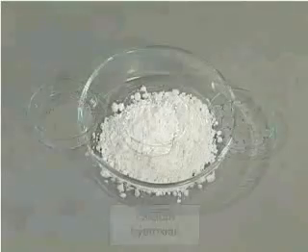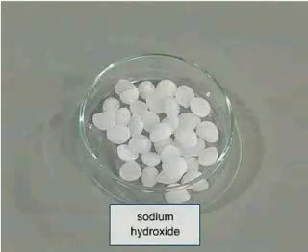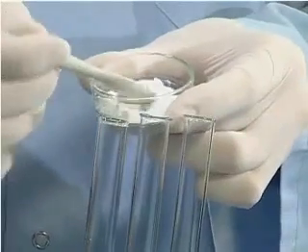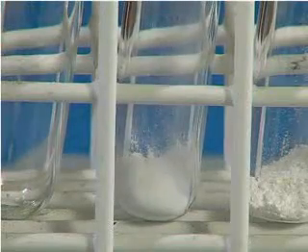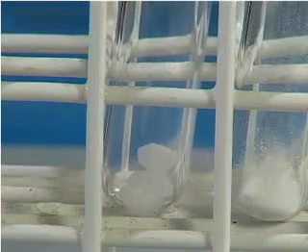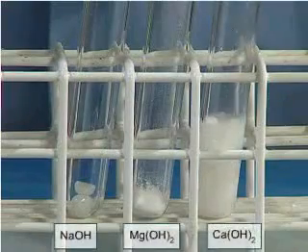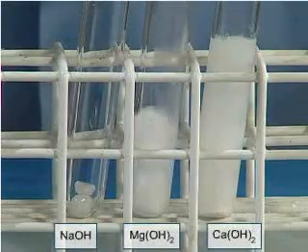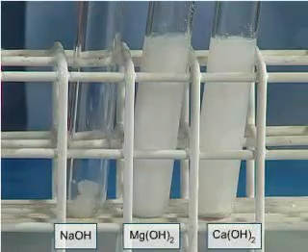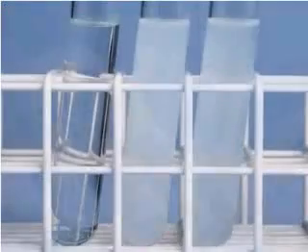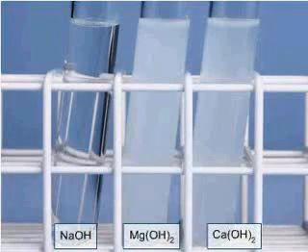Let us investigate the water solubility of calcium, magnesium and sodium hydroxides. We will do an experiment for this purpose. We add equal small amounts of calcium, magnesium and sodium hydroxides to three separate test tubes. Next, we add water so the test tubes are one third filled. We shake the test tubes vigorously.